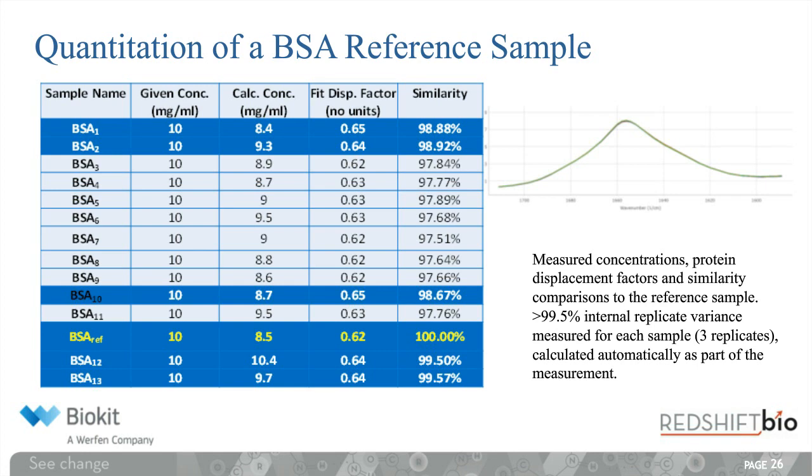And if we look at this table, we can notice that the samples performing okay, highlighted in blue, showed to be more similar to the reference sample than the rest of the samples. And this similarity showed to be larger than 98%.